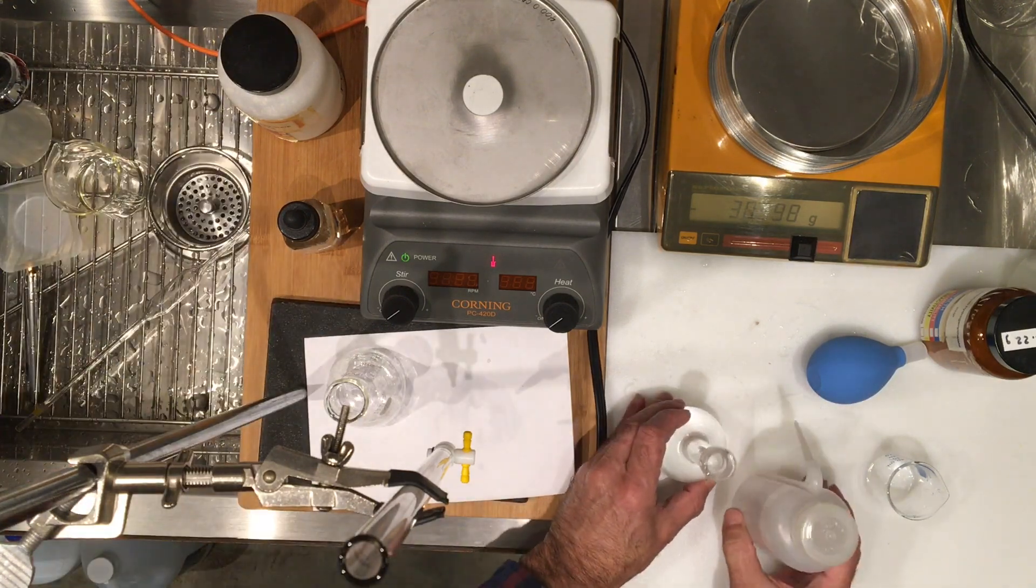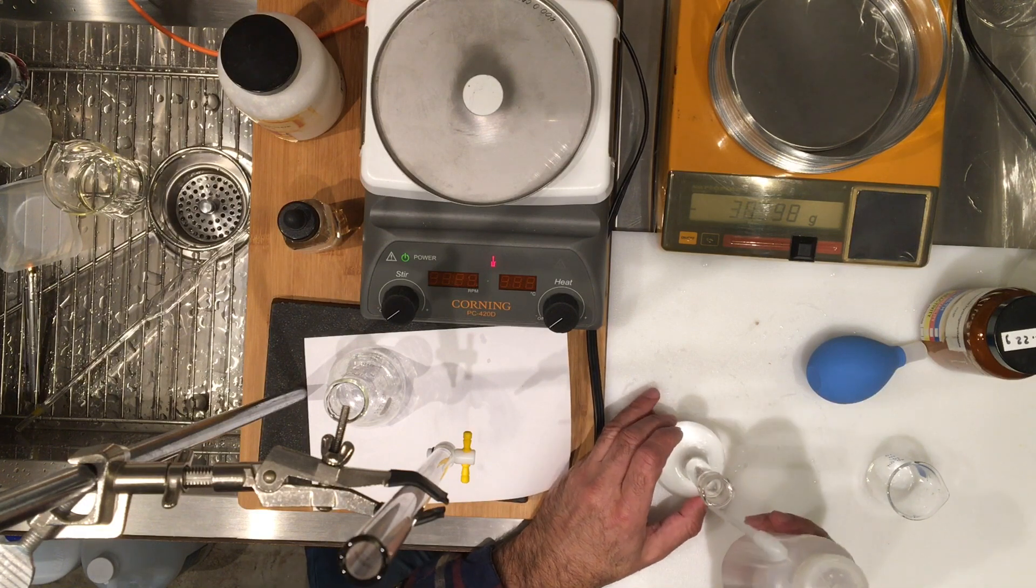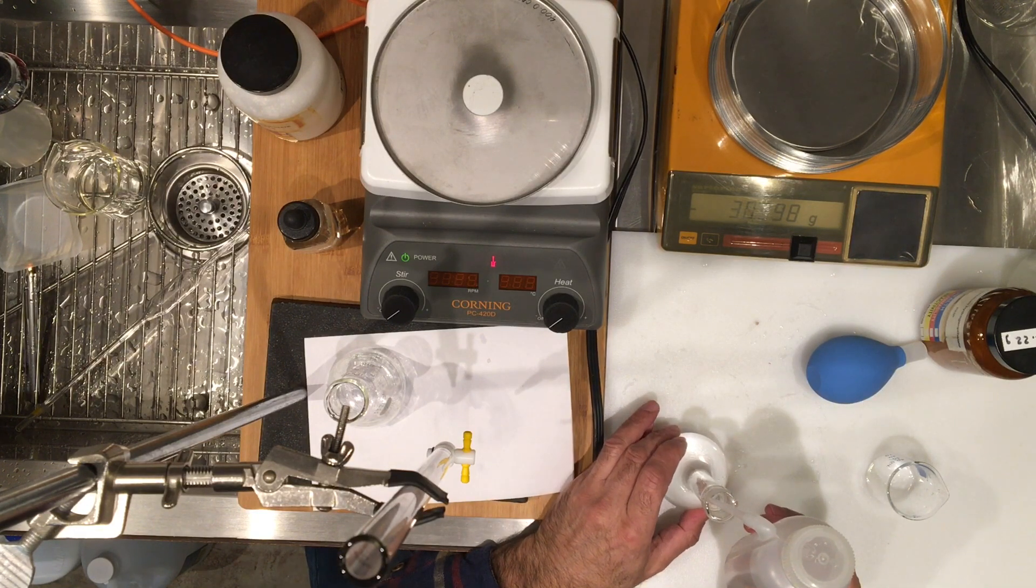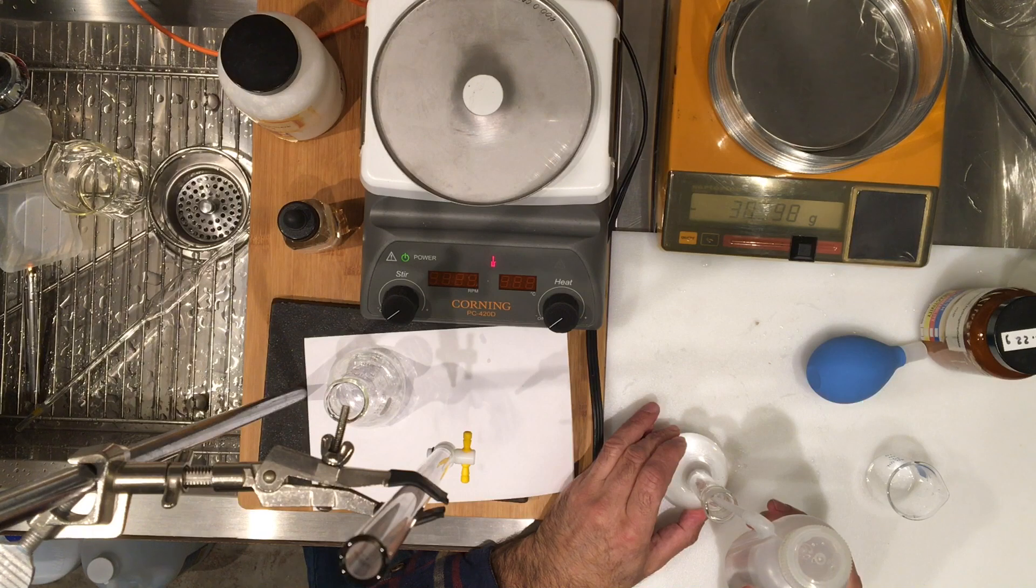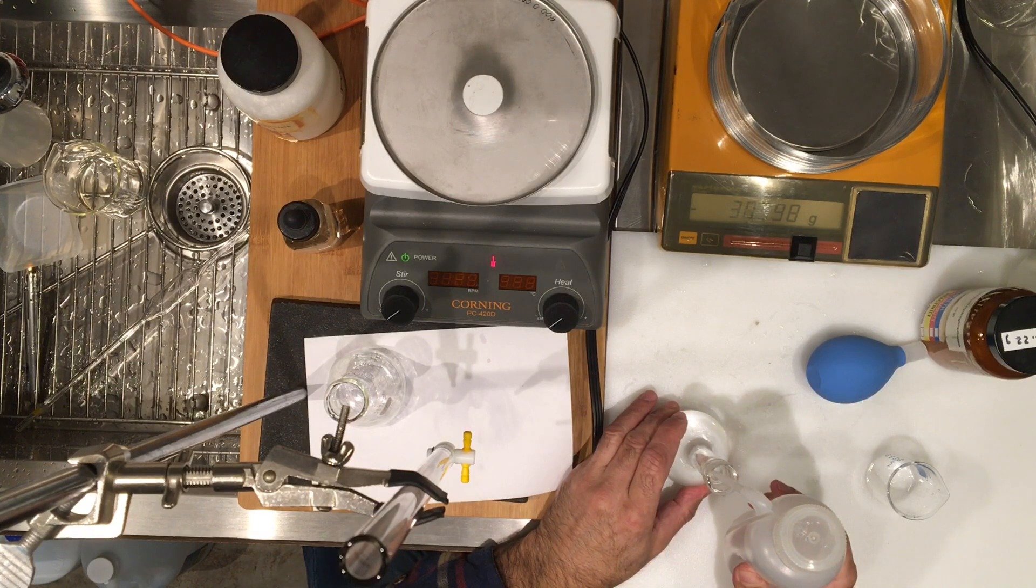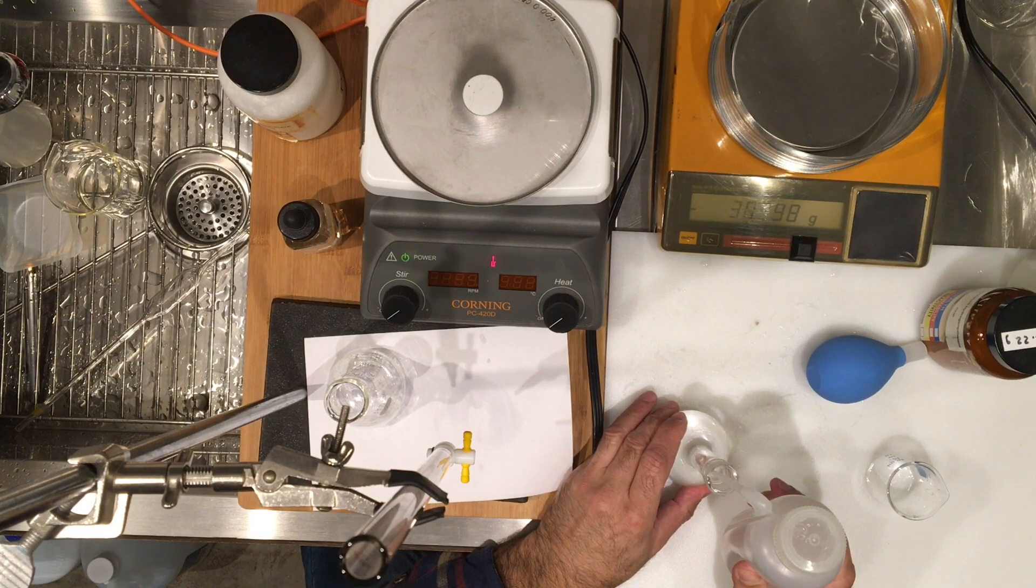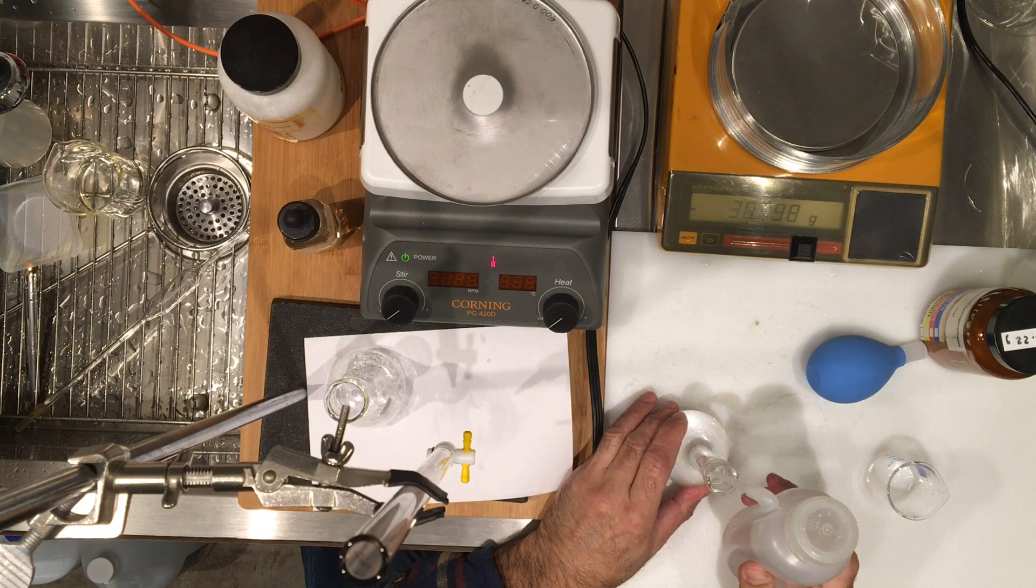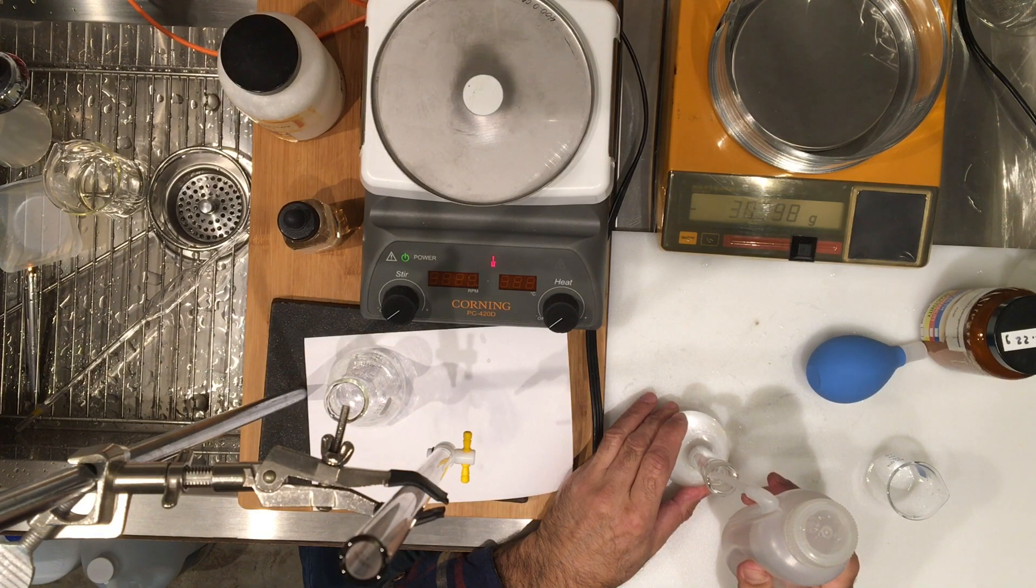So now I'm going to get my eye level with the marking of the flask, and very gently, gradually add my DI water to where the meniscus is in line. The bottom of the meniscus just touches the line.